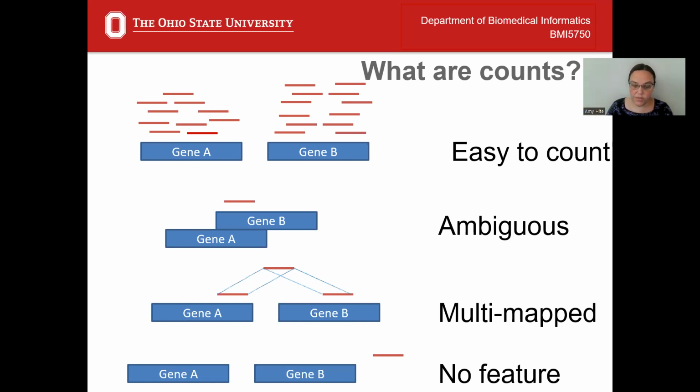And we're going to use differential expression. Now, later on in this class, we're going to take a step backwards and we're going to say, how did we get these counts? We're going to have raw reads, we're going to map them to the genome, and then we're going to count them. But we're not to the point where we're going to learn about that kind of computing environment. So we're just being really simple here. We're assuming that you download publicly available data. You just want to do some differential expression analysis.